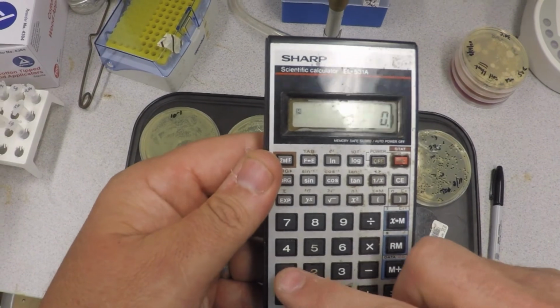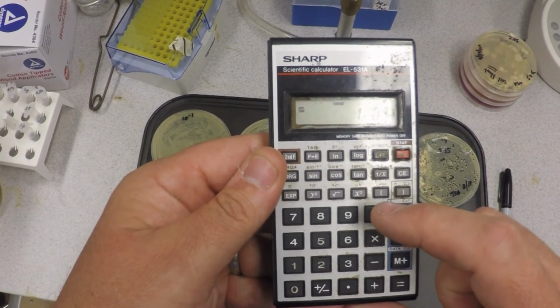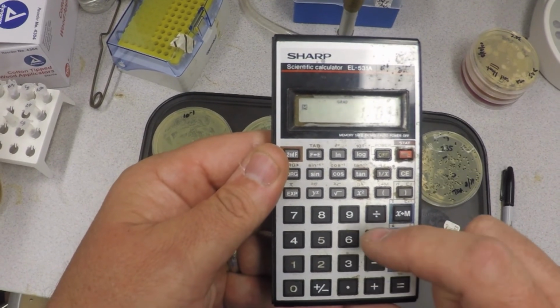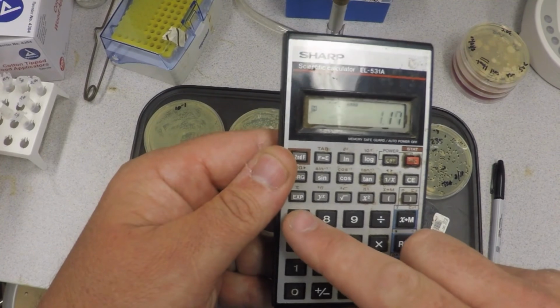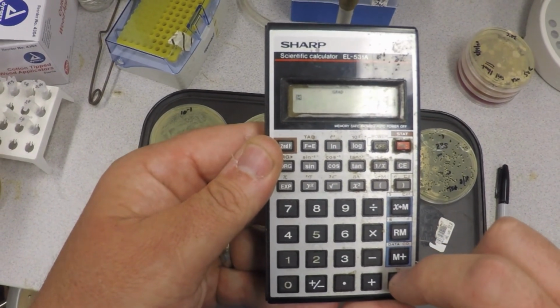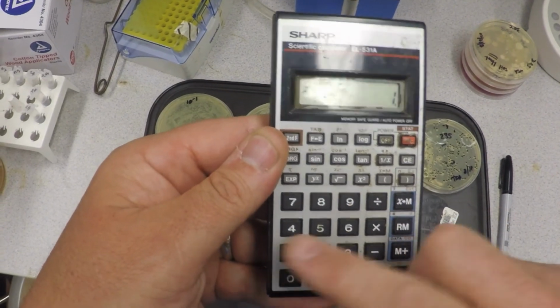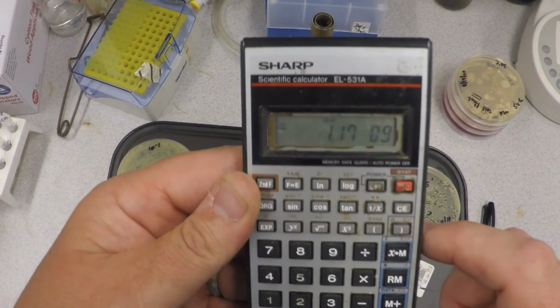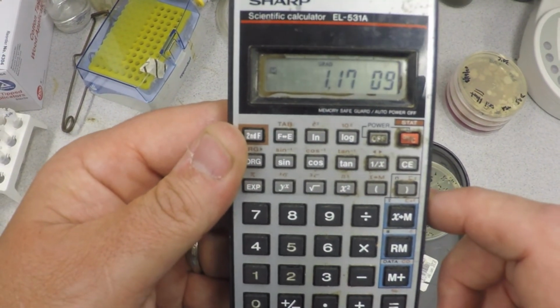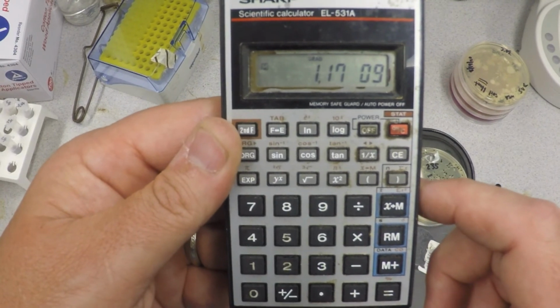So let's see. 1 times 10 to the 9th times I guess 1.17. I think that was right. Okay, and divided by, of course, 1. Just setting up a proportion. So the estimate from the spec is 2 orders of magnitude higher. Okay, one was 10 to the 7th, one was 10 to the 9th.